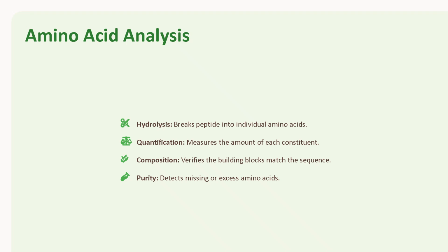This technique is particularly useful for verifying sequence composition and detecting missing or extra amino acids that may result from synthesis errors or degradation.